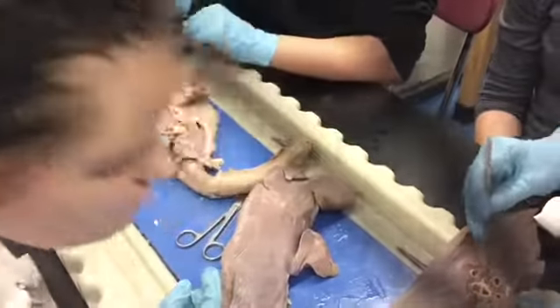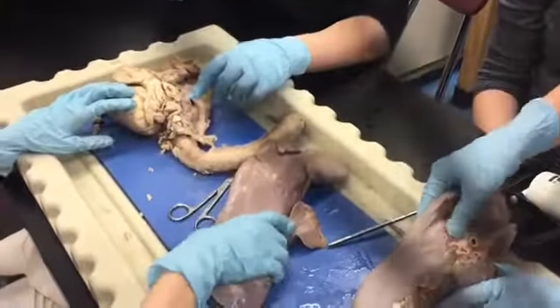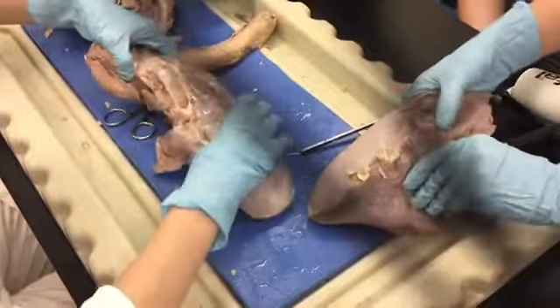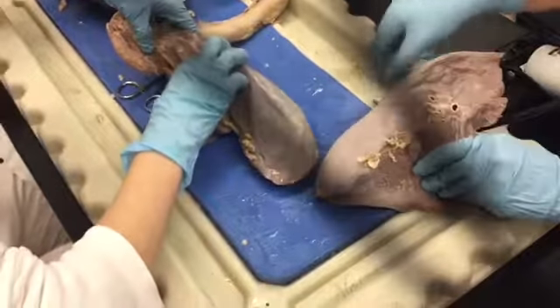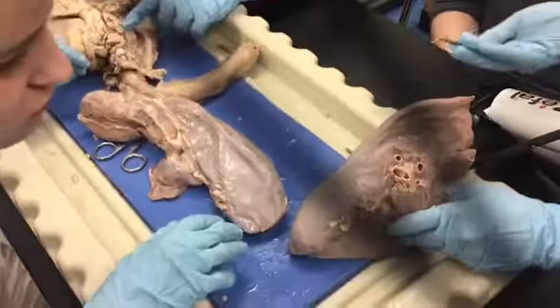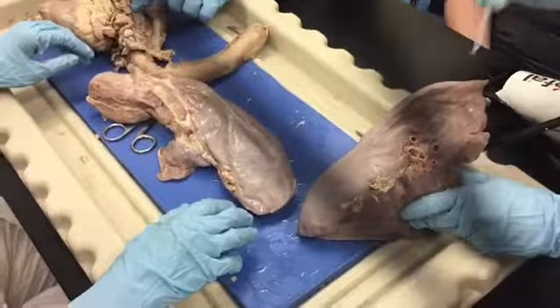Over here is an artery. So you can kind of feel the difference. The bronchioles have a whole bunch of cartilage on them, whereas this, when you feel it, it's not cartilage. This is an artery. It's a lot thicker because arteries are under a lot higher pressure. So you just need that extra. I guarantee this is a question tomorrow.